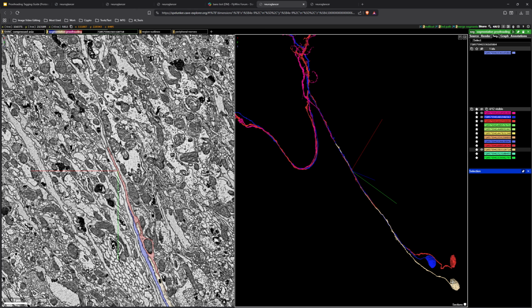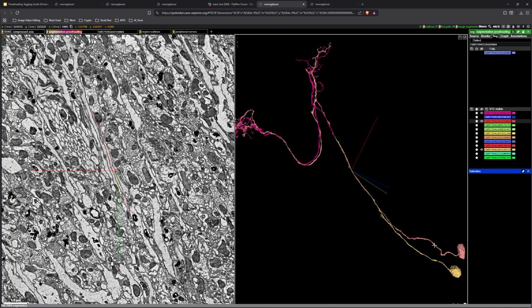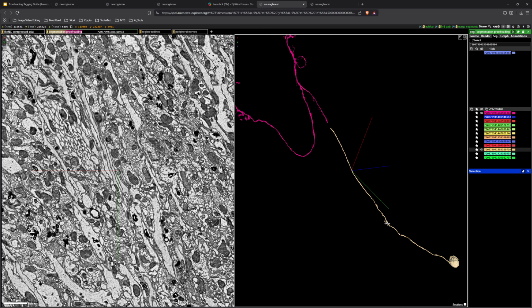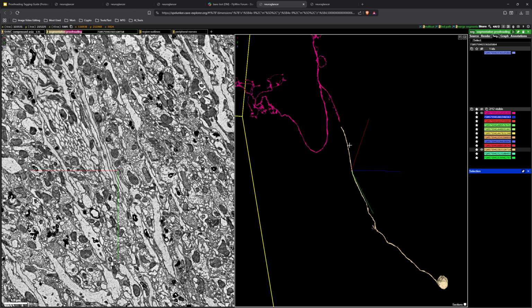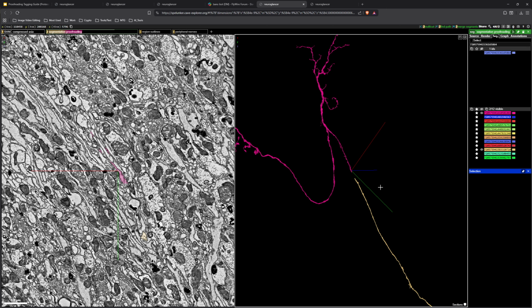And when we had all those other cells up, every single cell had a soma except our cell. These cells look very similar to our cell, so we could say they're probably a similar cell type. And when you just look at it like that, it's the only soma path that exists, that's possible, that isn't already attached. And this is the only top part of an incomplete cell that doesn't have a soma.